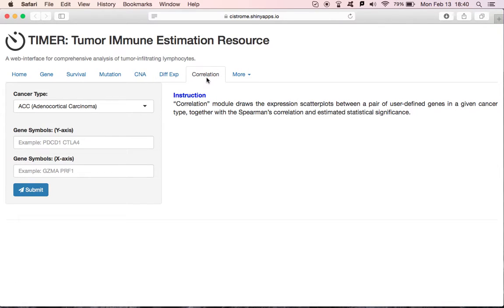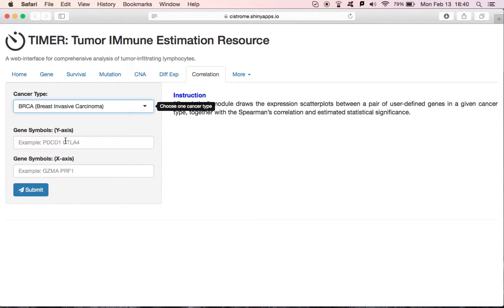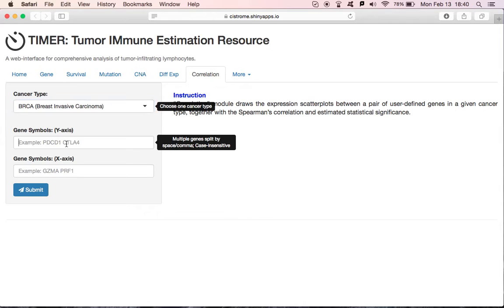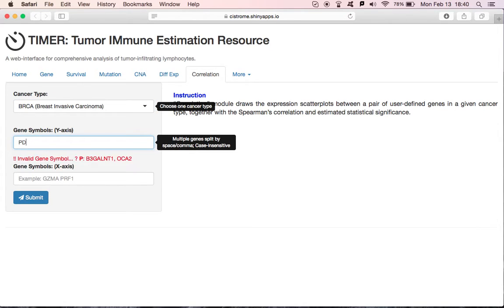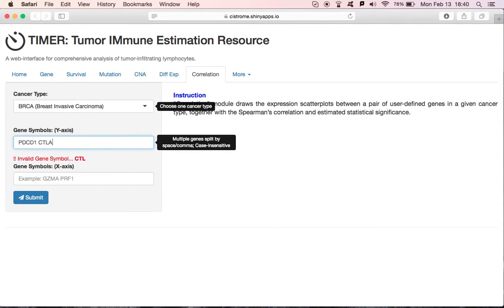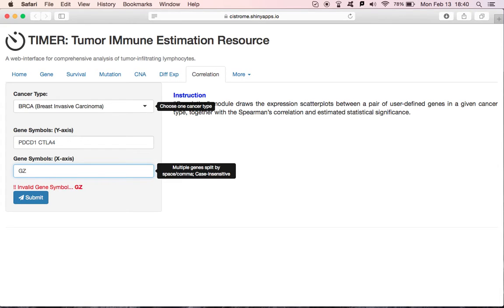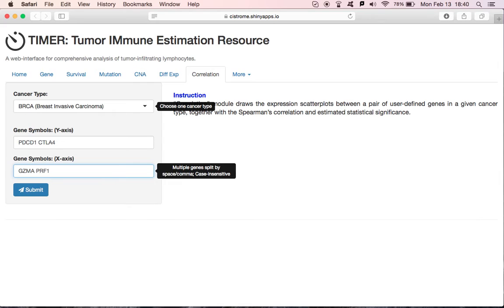The last module is the correlation module. It draws the expression scatter plots to compare the correlation between two gene sets. If we choose BRCA as the input, for example, and the y-axis for PDCD1 CTLA4, and the x-axis as GZMA PRF1, and click Submit. The scatter plots give you the correlations that you can compare.